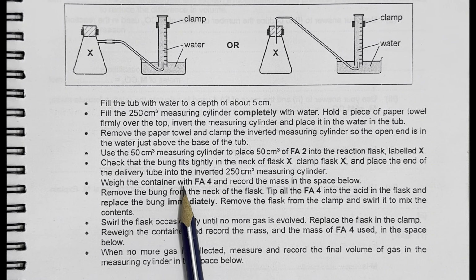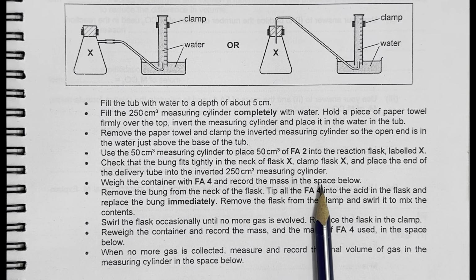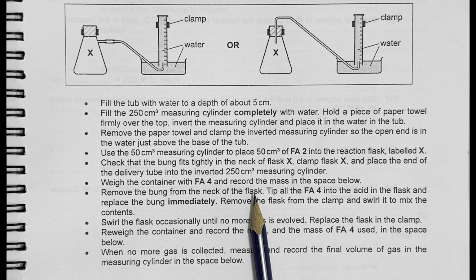Weigh the container with Fa4 and record the mass in the space below. Remove the bung from the neck of the flask. Tip all the Fa4 into the acid in the flask and then replace the bung immediately. Remove the flask from the clamp and swirl it to mix the contents. Swirl the flask occasionally until no more gas is evolved. Replace the flask in the clamp. Then reweigh the container and record the mass of Fa4 used in the space below.